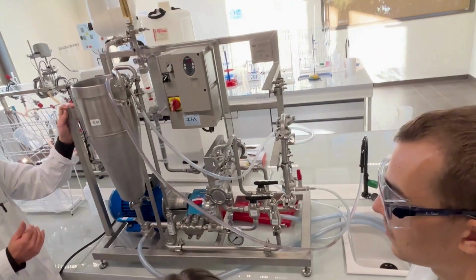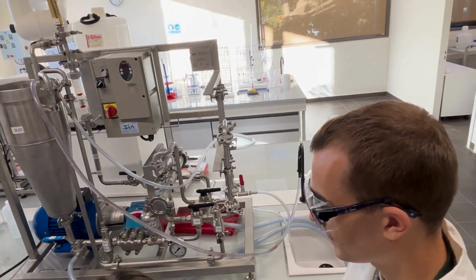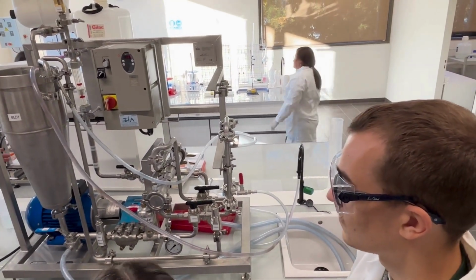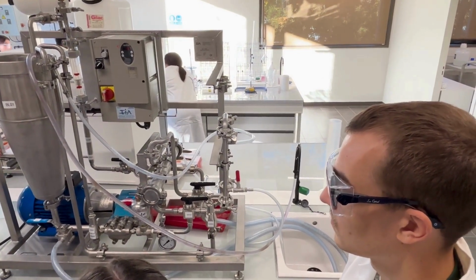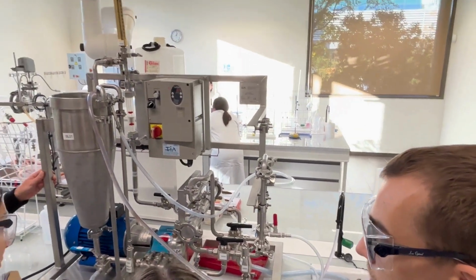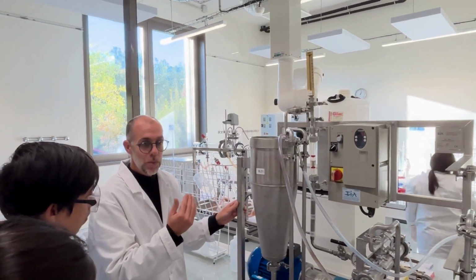To soften tap water using the nanofiltration setup, begin by turning on the system and ensuring the drive display is lit. Select the organic circuit using valves VB101, VB102, and VB103, and close drain valves VB01 and VB06. Fully open valve VR51 and fill the tank with cold tap water, ensuring both retentate and permeate outlets are directed to the tank to prevent the pump from running dry.